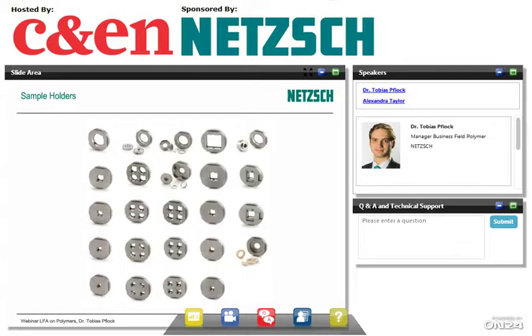Is the sample volume critical in this measurement, and does it normalize the sample dimension when comparing a film sample to a powder sample made of the same material? You would have to take the sample dimensions into account, because the thickness of your sample enters the calculation of your thermal diffusivity. So we have to normalize our thermal diffusivity with respect to the thickness.